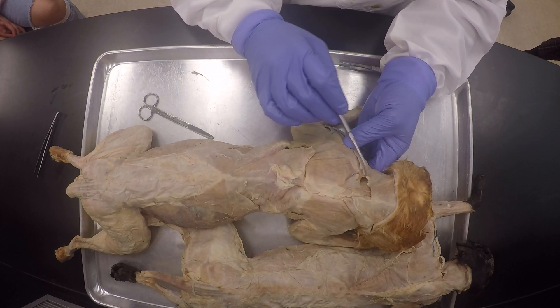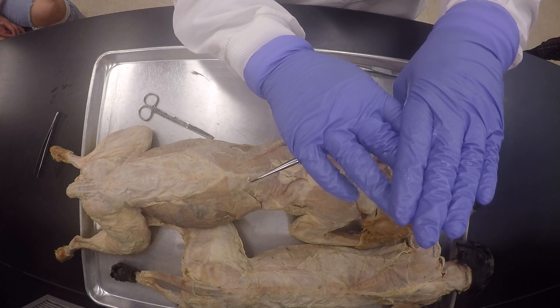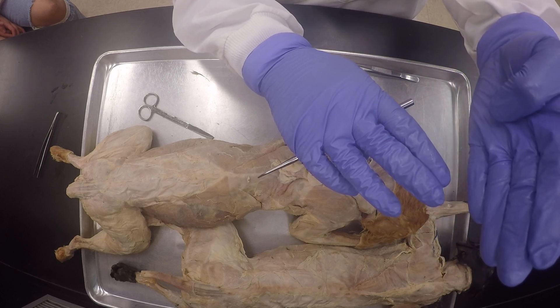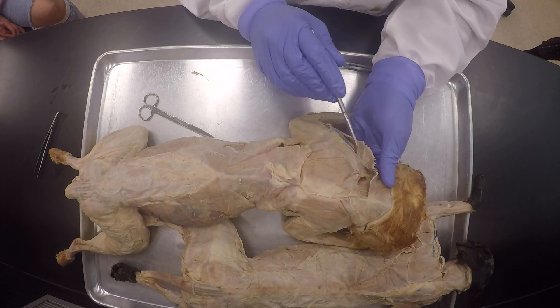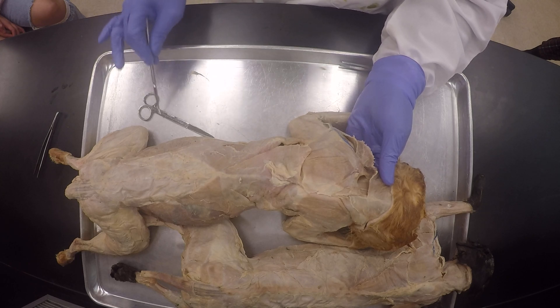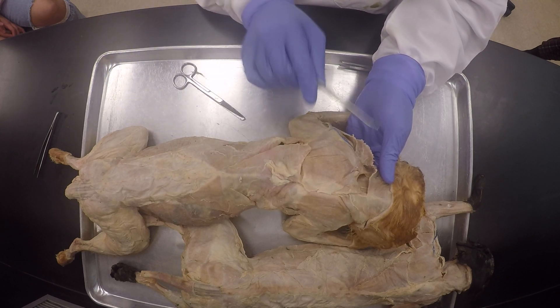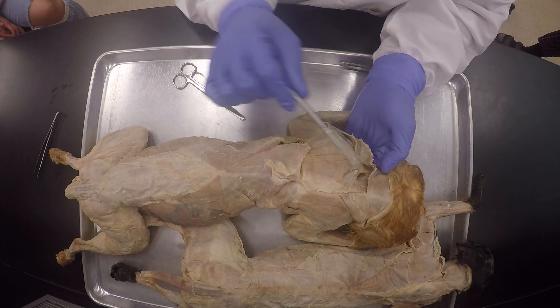The clavotrapezius covers the levator scapulae like that, and they're all sort of thin bands of muscle, so you want to peel the clavotrapezius off first. You work on that area using your blunt probe and blunt end scissors, sometimes using your sharp end to just pick on that connective tissue. Make sure you're only picking on the connective tissue, not the muscle.